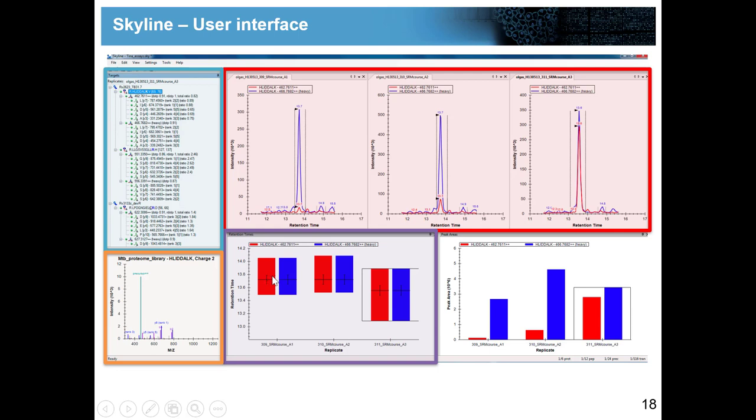This is the retention time replicate comparison. You see here on the y-axis the retention time and on the x-axis the three different samples. You can always see the start and the stop, so the two boundaries where Skyline picked a peak. These are the two dashed lines up and down, the black line is the peak apex that you see. You can see that I have the same boundaries for light and heavy in the three different samples but I have slightly different retention times, but still very similar.